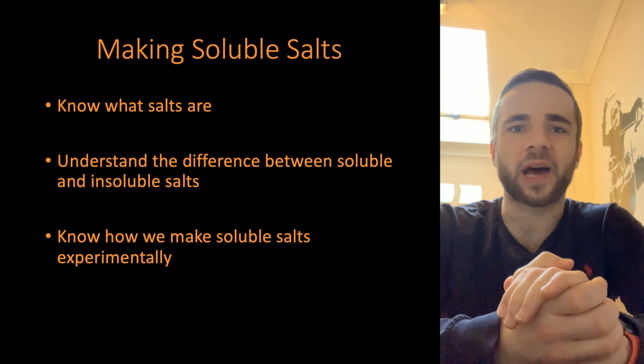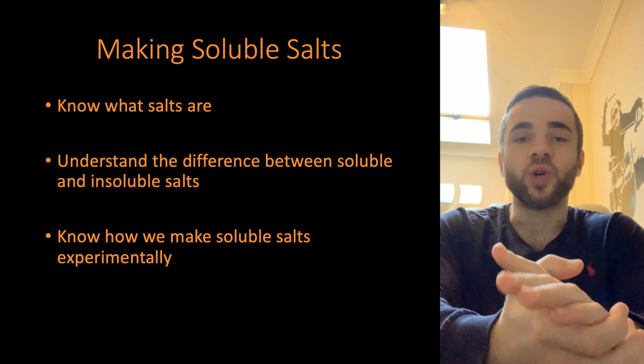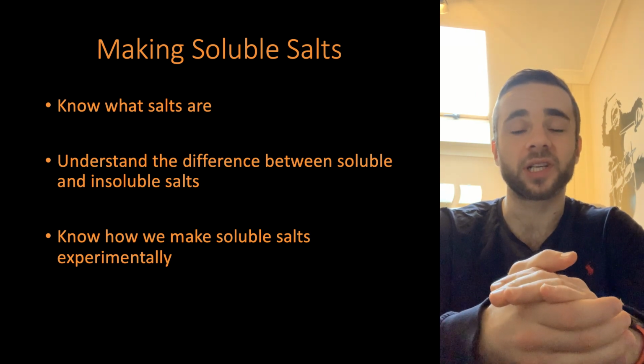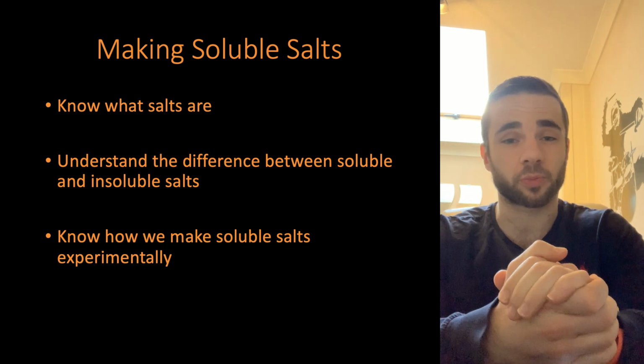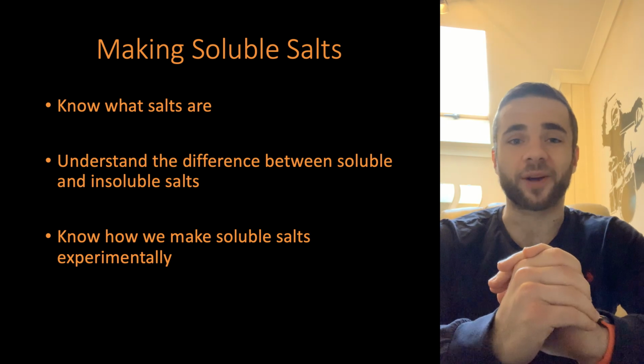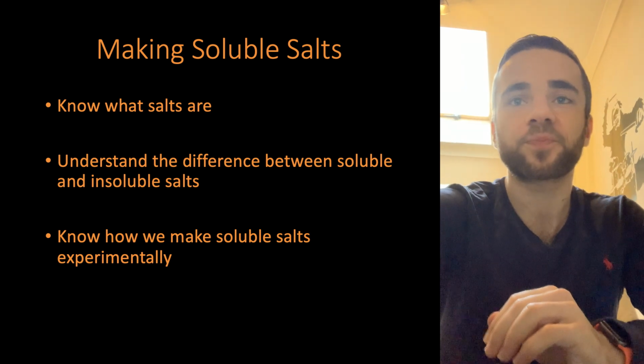So we're going to have a look at exactly what salts are. We're going to have a look at the differences between a soluble and an insoluble salt. And finally, we're going to have a look at the experimental procedure in order to produce soluble salts. Okay, so let's have a look at that right now.